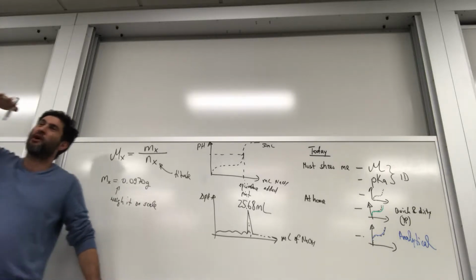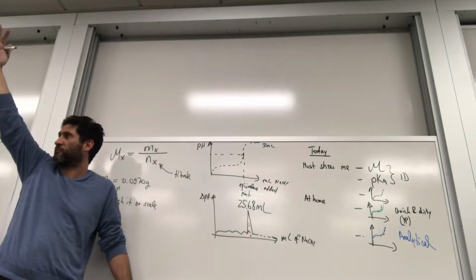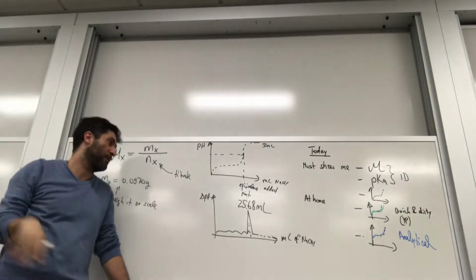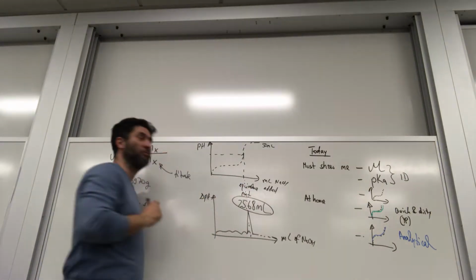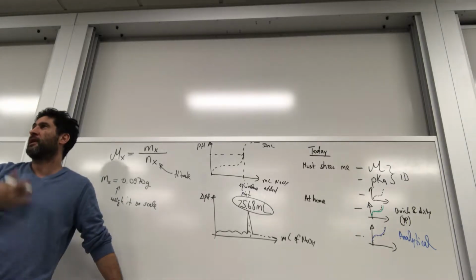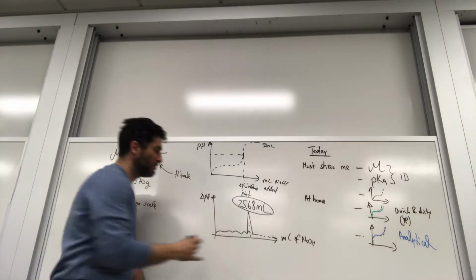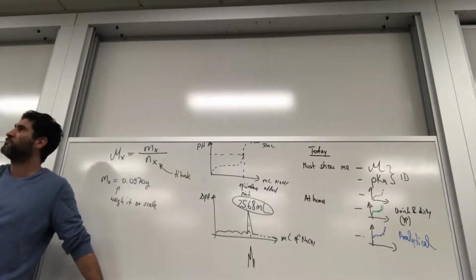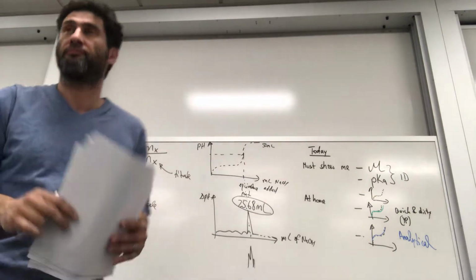Because at the equivalence point, tiny amounts of volume have huge changes in pH. Okay, great. So if I want to know what is this exact volume, I make a second graph. Delta pH as a function of milliliters of NaOH added, and where it peaks. Some people have bad luck that they might have a double peak or triple peak, but where it peaks approximately, that's the equivalence point, and we'll discuss your data later in the lab.